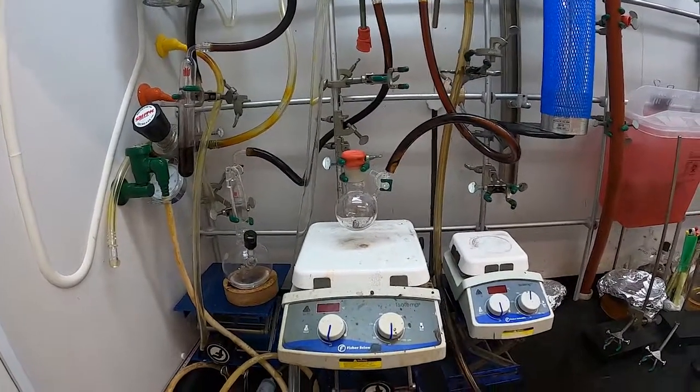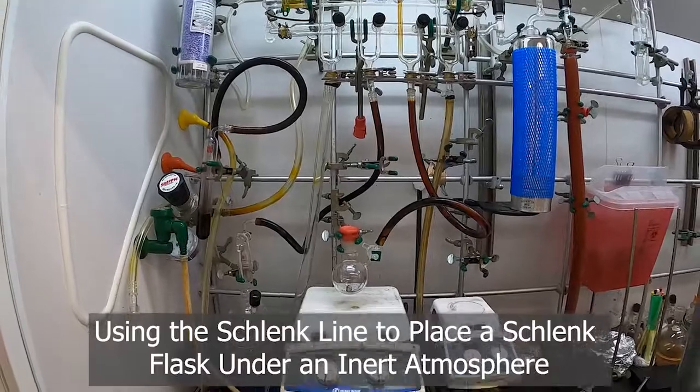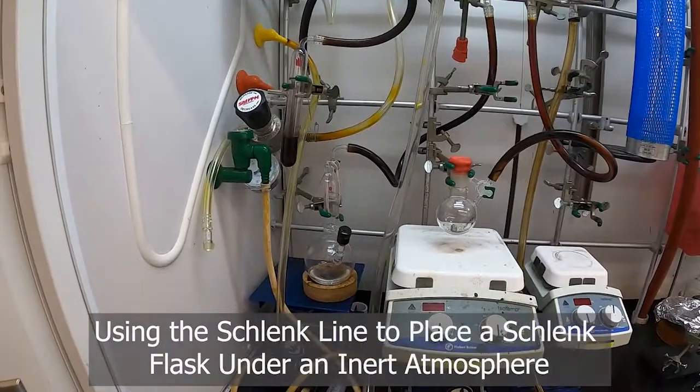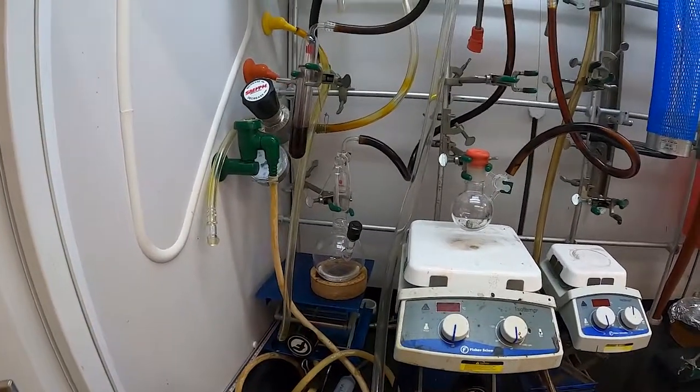So now that our Schlenk line is prepared, and say we have this flask here that we want to cycle so that we can put solvent in it from this storage flask of dry solvent.